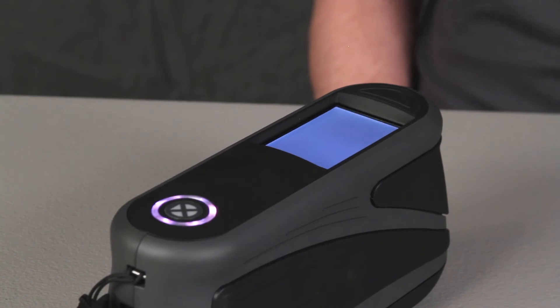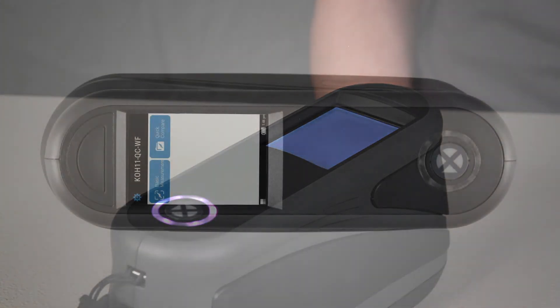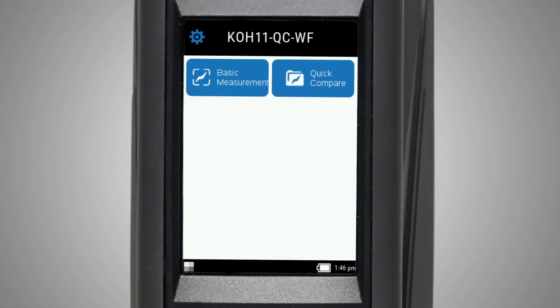The circular multi-color LEDs will also turn on. White indicates the instrument is powered on. The display is a touch screen. Tapping an icon will take you into that option.